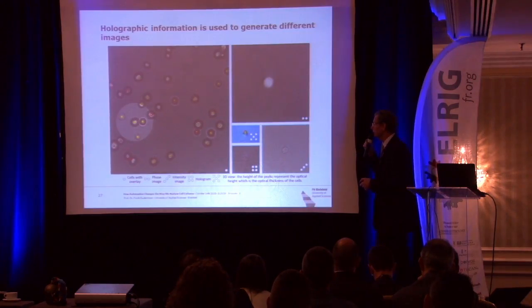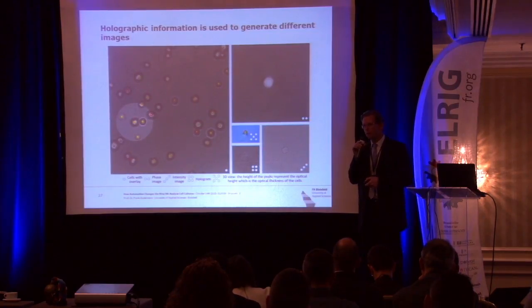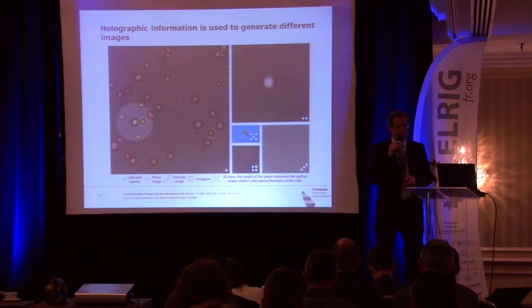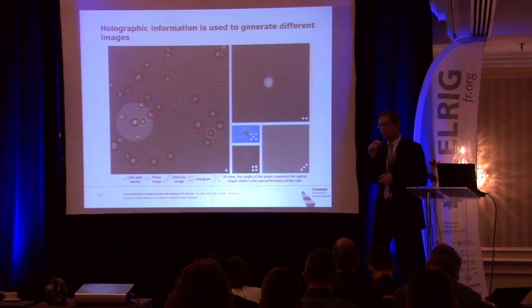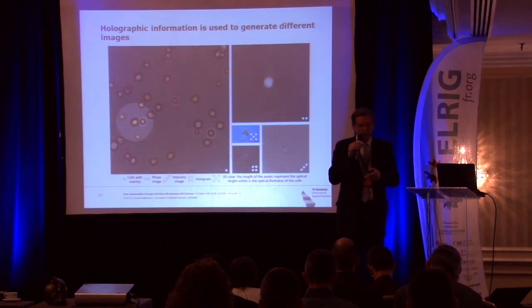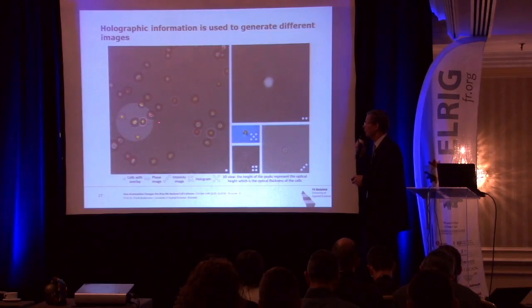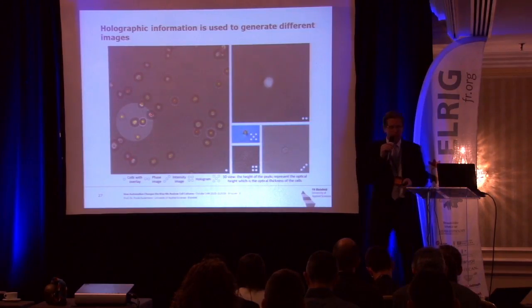And that is sort of logical because the optical density of cells that are alive is of course different than the surrounding media, because there's a compartment, there's the cytoplasm in it. When cells are dying, they form holes in the membrane. And that's the effect when trypan blue can enter a cell. And here the surrounding media enters the cell, and the cytoplasm and the compartments of the cells diffuse out. So the phase contrast is almost the same as the liquid, but definitely different from viable cells. And that's what those technologies use to discriminate between viable and dead cells.